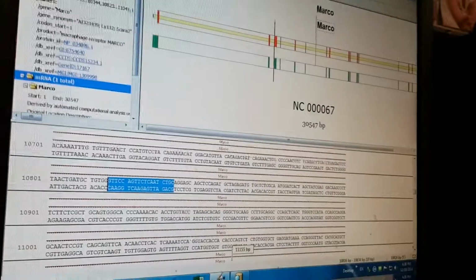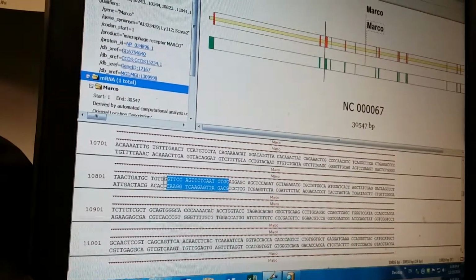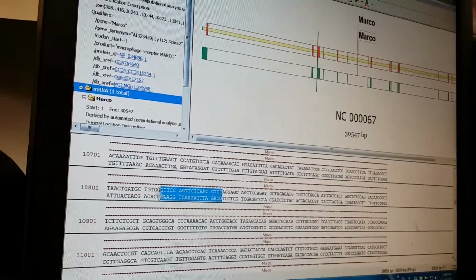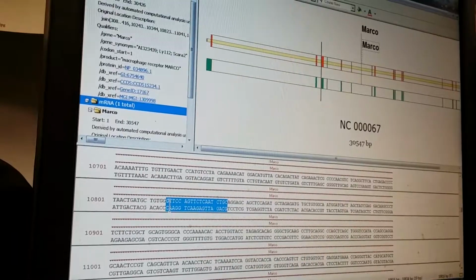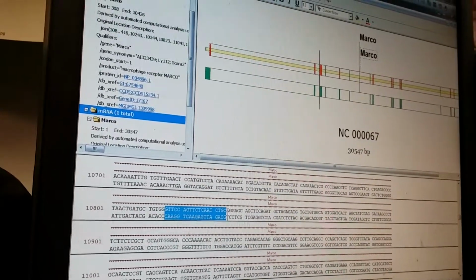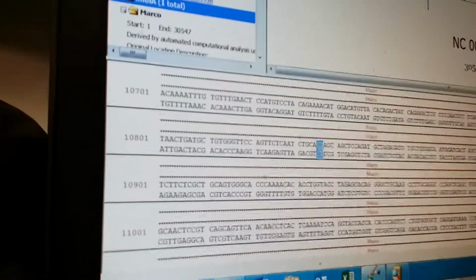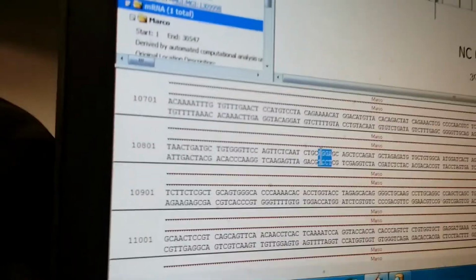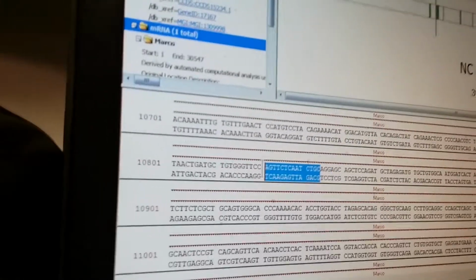Are there 2 G's there at the beginning? It looks like a GC. Is that 2 G's or GC? This is 2G. Oh, 2G there. Yeah, just need 1G. So this is 19 base pair GGN. Which G is the beginning G? Those 2 G's, yeah. This 2G is the beginning G. And then you go 19 after that, and it should be a G.